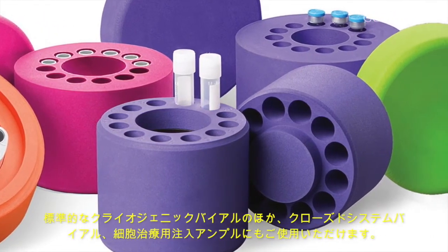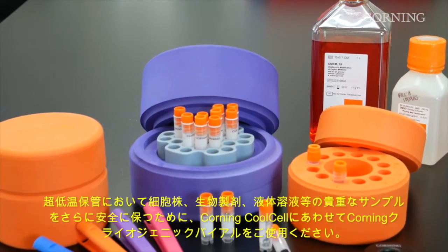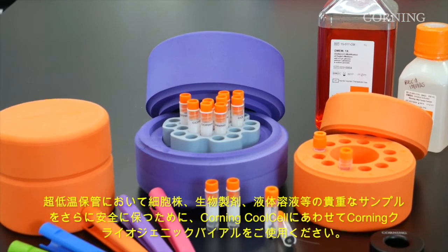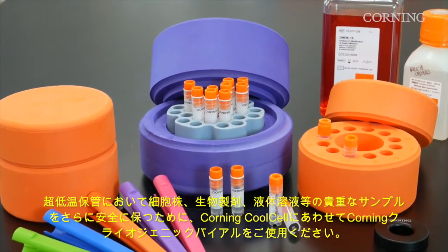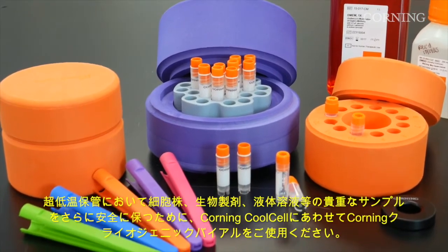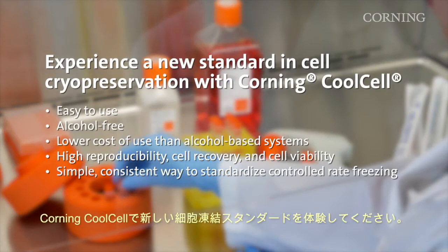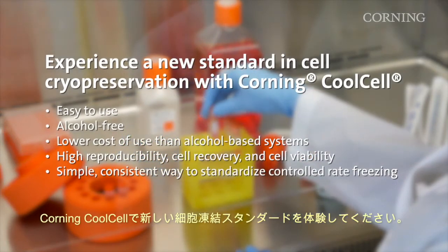Corning Cool Cell may be used with standard and closed system cryogenic vials as well as injectable cell therapy ampules. Combine Corning Cool Cell with Corning cryogenic vials and DMSO to further protect your valuable cells, biological, and aqueous solutions in ultra low temperature storage. Start using Corning Cool Cell to experience a new standard in cell cryopreservation.